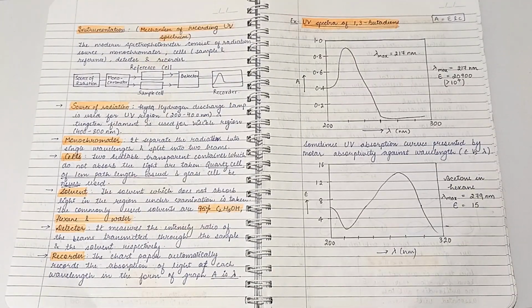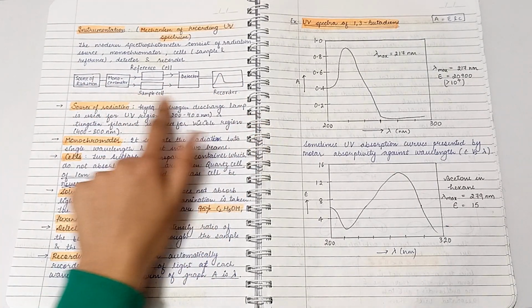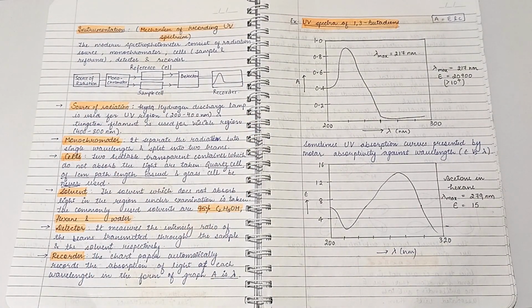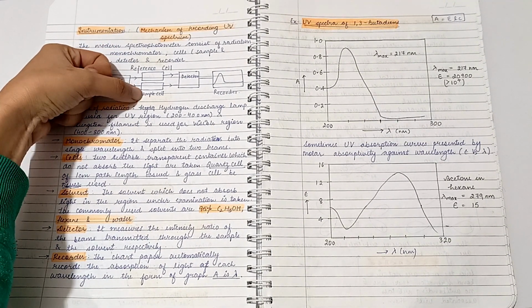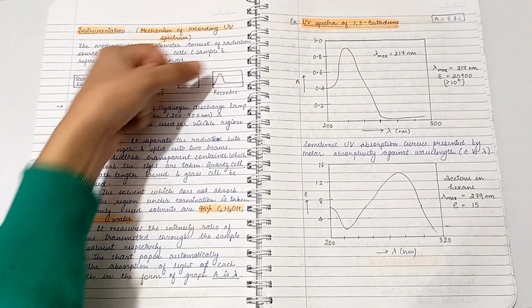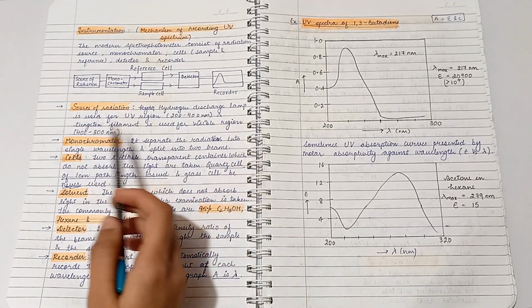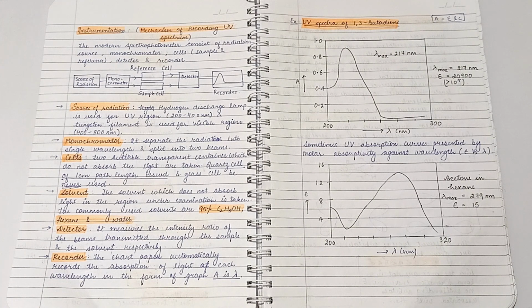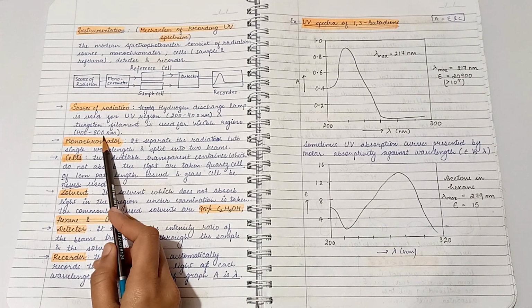Now let us see the instrumentation of a UV spectrometer. The modern spectrometer consists of radiation source, monochromator, cell, detector and recorder. So this is a simple diagram of the instrumentation. First we have the source of radiation, then we have a monochromator. This is a reference cell and this is a sample cell. This is a detector and this is a recorder. The source of radiation: a hydrogen discharge lamp is used as the UV region source, and a tungsten filament is used for the visible region, that is 400 to 800 nanometer.